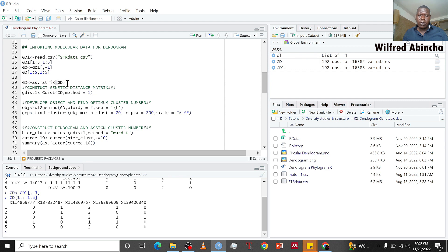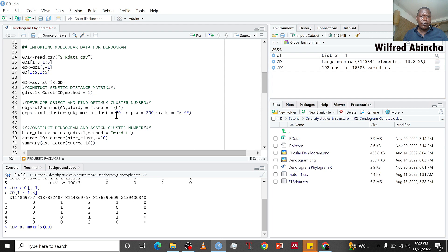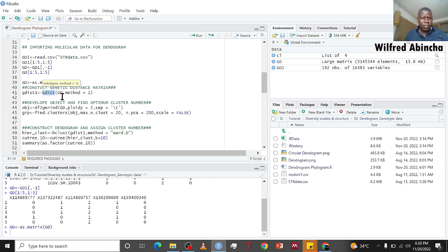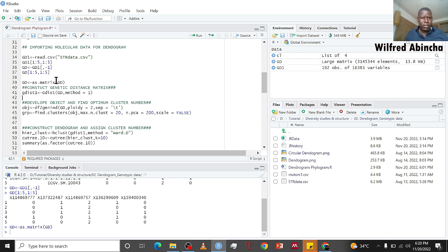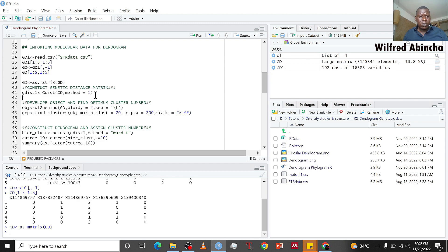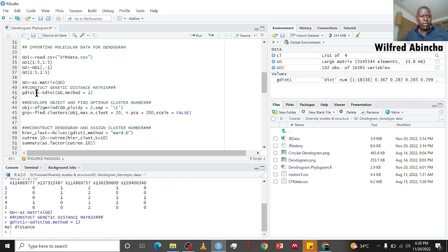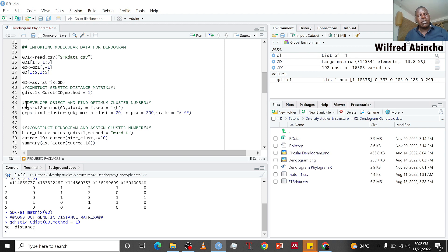Let's use the gdist function to make a genetic distance matrix. Gdist is only for genetic distance matrix. I'm going to use gd which we've converted as a matrix, and I'm going to use method number one and call it gdist1. Now we have made a genetic distance.